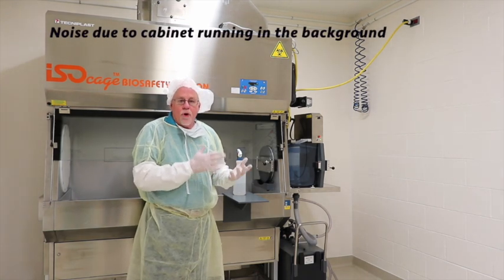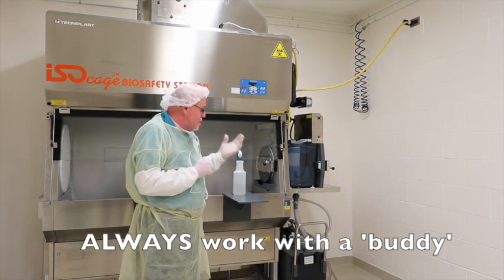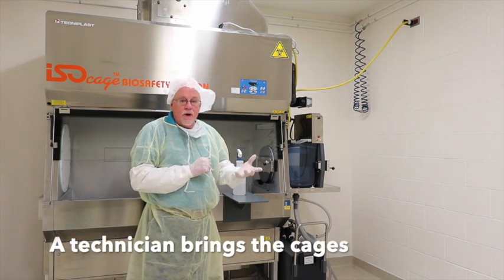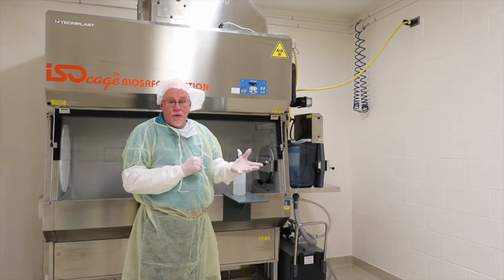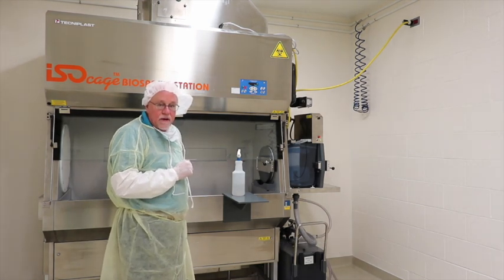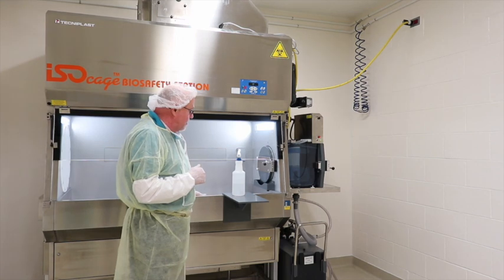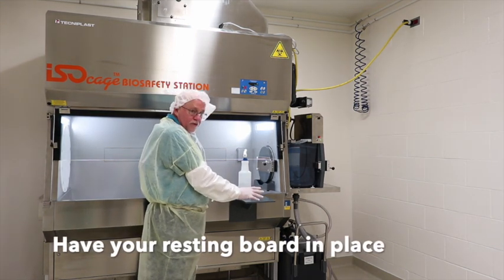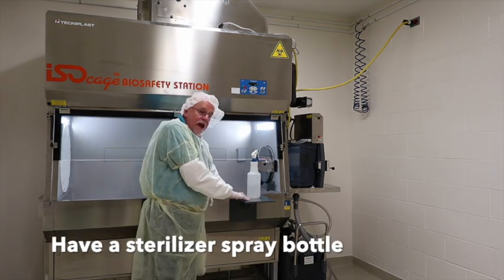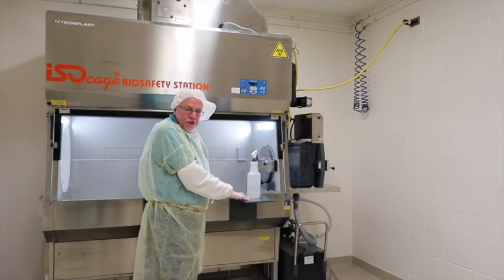We're now going to show how we work inside of the biosafety cabinet. You always work with a buddy — one technician doing the manipulations inside the IBS, and another technician bringing the cages that are clean on the inside but dirty on the outside, putting them through the dump tank of the IBS to sterilize the outside. First, make sure the light is on so you can see what you're doing. I have the resting board for transporting and working inside. I also have a mat underneath where the dump tank is, because as cages come out they're wet, to minimize moisture inside the IBS.